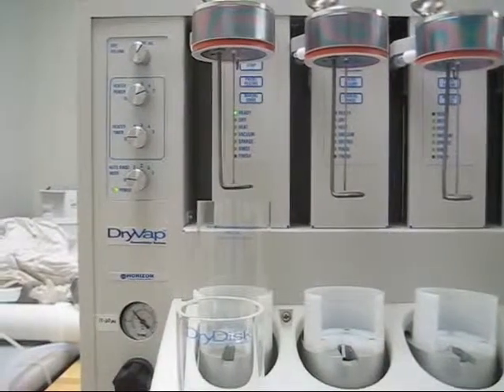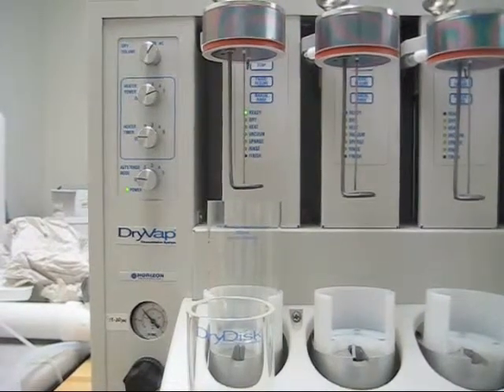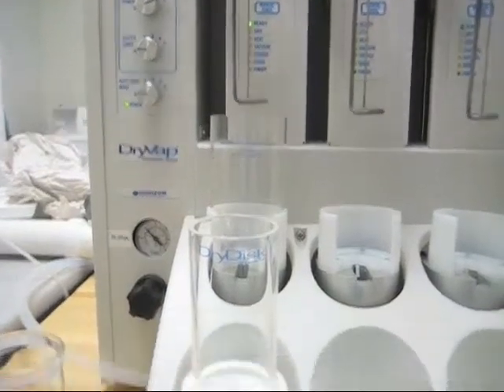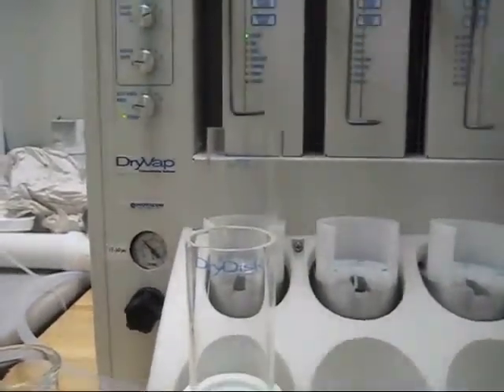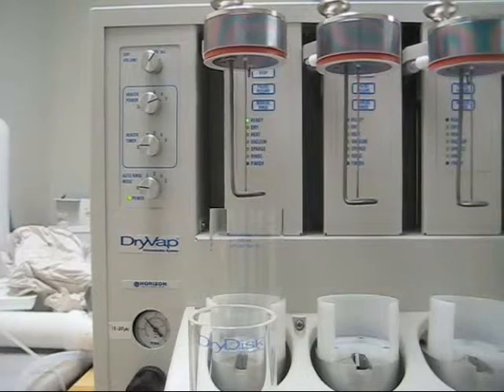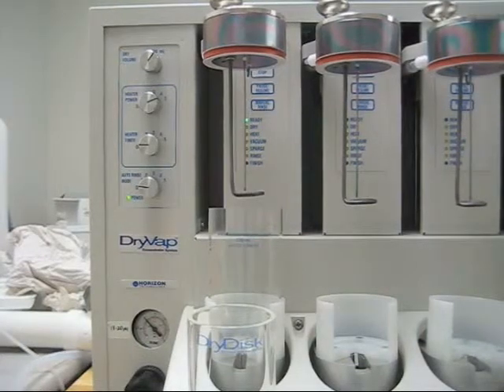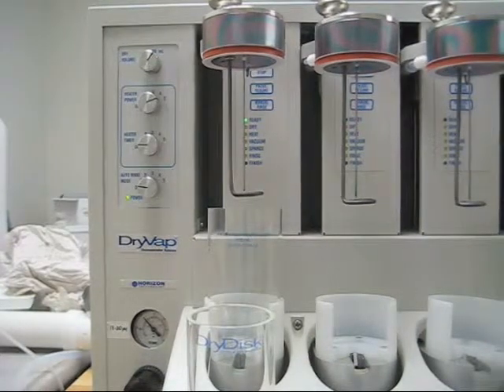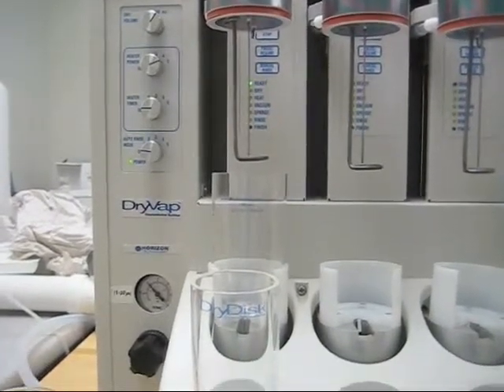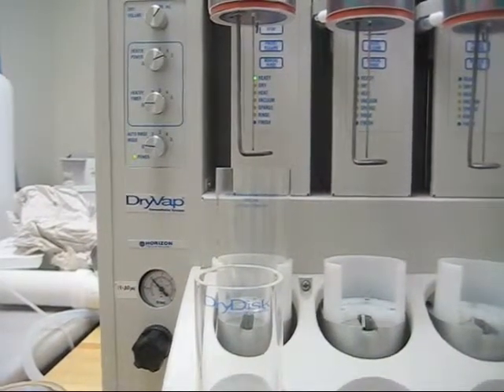These are the settings for each individual station. I've set this on a dry volume of 200 mils — that's a time-based event and it pulls a vacuum through the dry disk for about three and a half minutes. The heater power we leave on five, which is 60 watts. The heater is always going to go to the boiling point of that solvent, so changing the heat power only affects how long it takes to get there. We're going to leave the heater timer off and the auto rinse mode off.